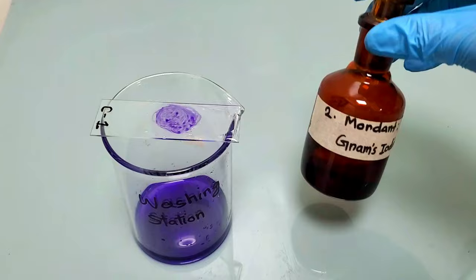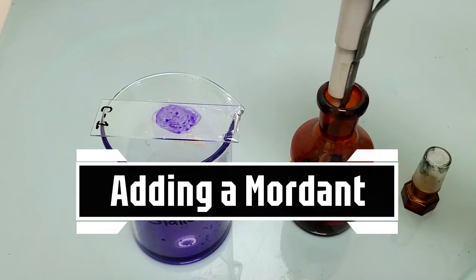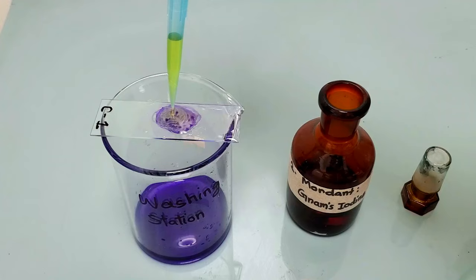In the second step, we will apply the Gram's iodine solution as mordant. Add a few drops of mordant on the glass slide in a way that it covers the smear completely. Wait for 1 minute.